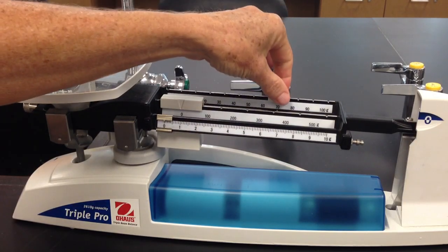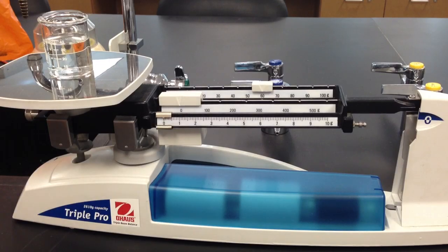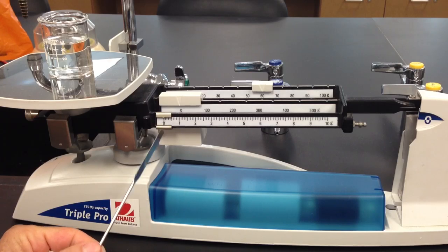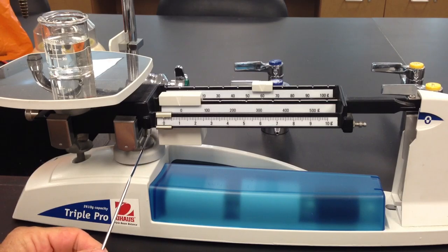So we know that the mass of the beaker with the liquid is 60 something grams. Now we go to our ones beam and use something with a tip other than your finger, otherwise it will make the beam oscillate too much.